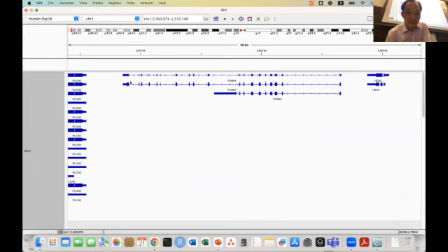And then, is there anyone who can explain the meaning of this thing? Big block, big block, big block, followed by a middle-sized block. Not really the line, but middle-sized. What is that final thing? Big block is the exon, right? Then what is the meaning of this intermediate size? Not so big, but not the thin line. What is that? Yeah. In this case, is it 5' or 3'? 3' UTR, untranslated region. Okay.